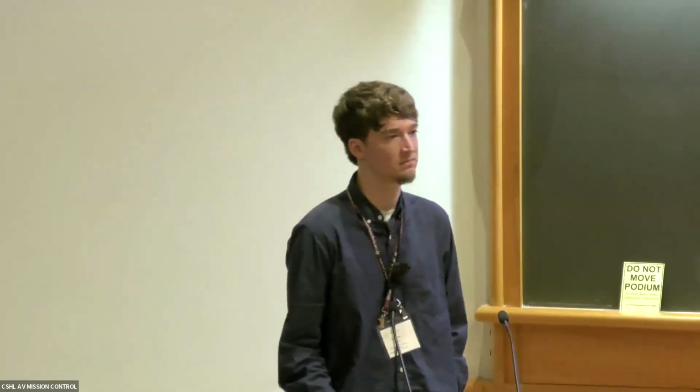Great talk. I'm definitely going to hunt you down later. So what I've been looking for with the HD is the cell, and then breaking up by cells. If you can do that, what is the point of going and doing it at the 2 micron resolution rather than, well, that's the whole cell? We think pretty well we can tell it's the whole cell. Why would you do it at a low resolution or any other resolution, instead of just saying this is my approximate cell?